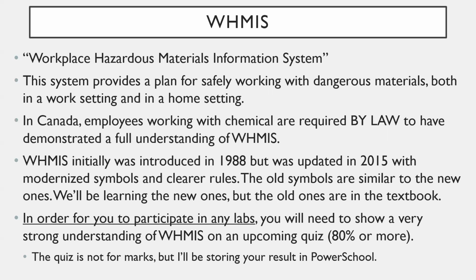Now WHMIS was initially introduced in 1988, but it was recently updated in 2015 with modernized symbols and clearer rules. The old symbols are similar to the new ones. We're going to be learning the new ones in this lesson today, but the old ones, of course, are in your textbook because your textbooks are from before 2015.